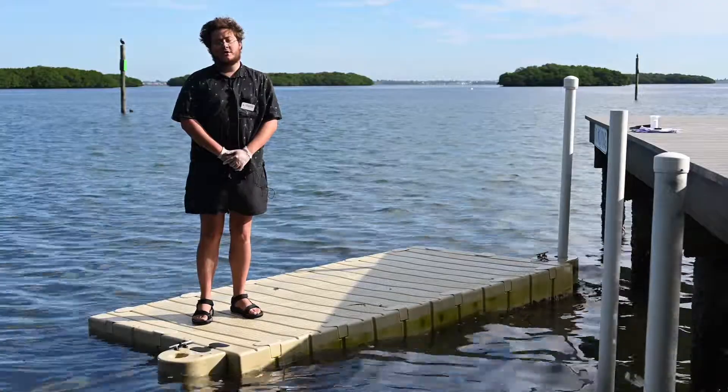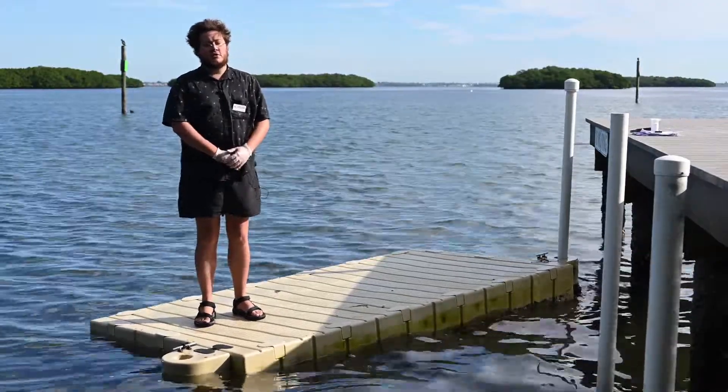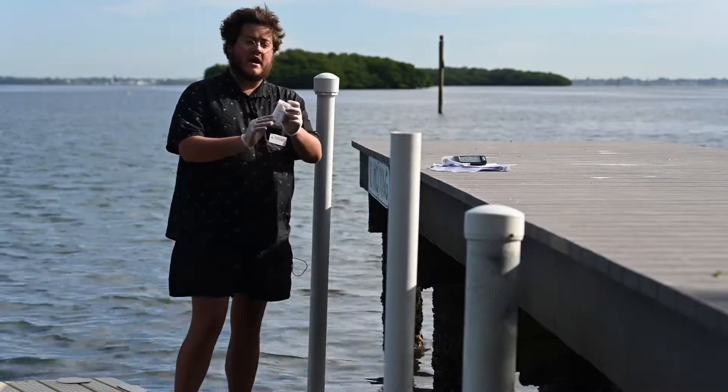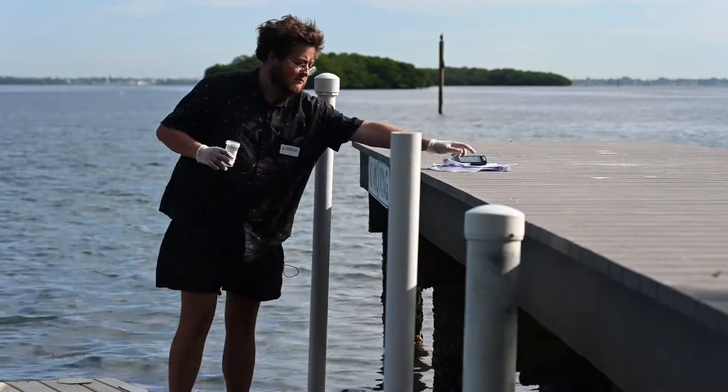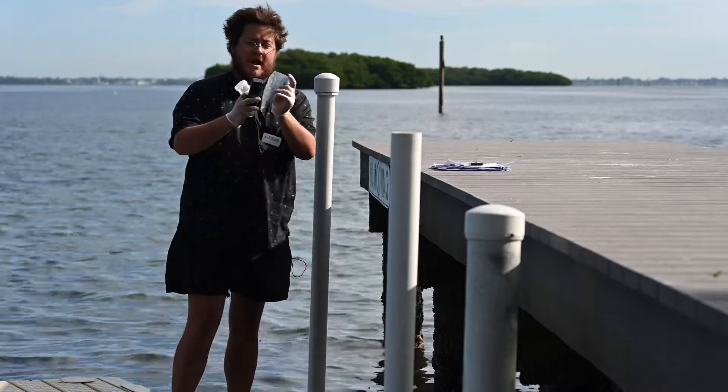Hi, I'm Alex from Suncoast Waterkeeper, and today I'm going to show you how to sample for enterococci. Before we do so, we're going to need to grab some materials: a sampling bottle with the label filled out with an indelible pen, a salinity meter, and a bag for your sample bottle.